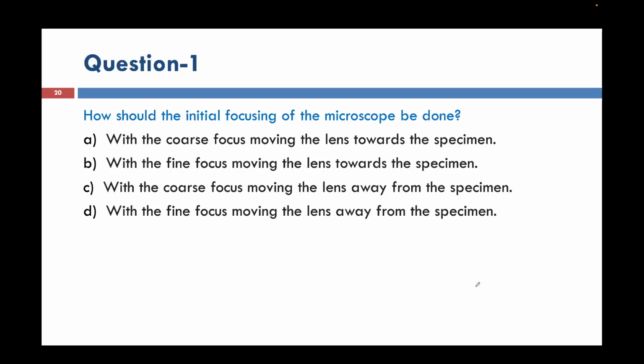What I have not gone through here is the method of preparation of the samples. We have seen in the videos how a sample for optical microscopy is prepared: cutting, mounting, grinding, polishing, and then etching. There are different kinds of etching, chemical etching and also thermal etching.